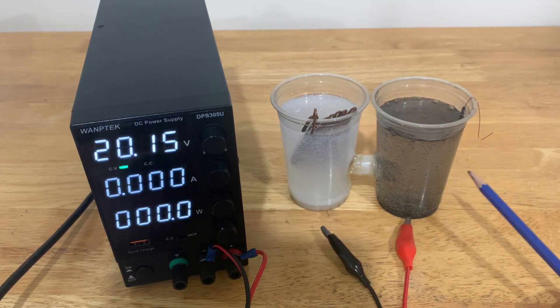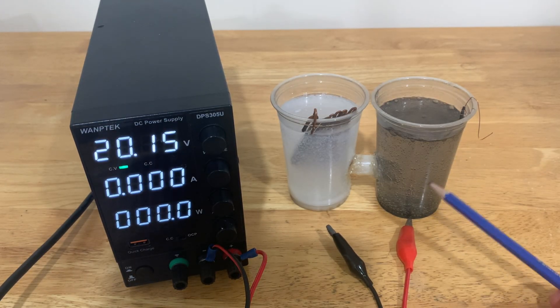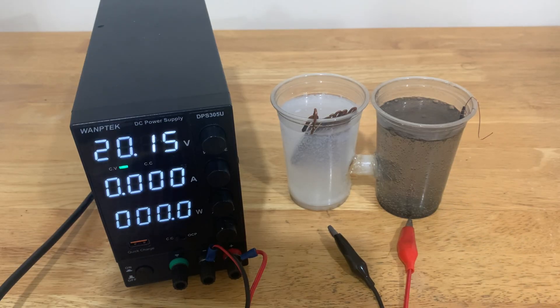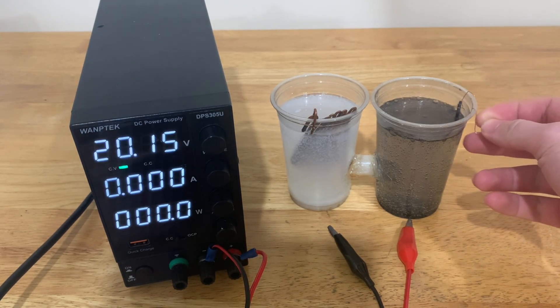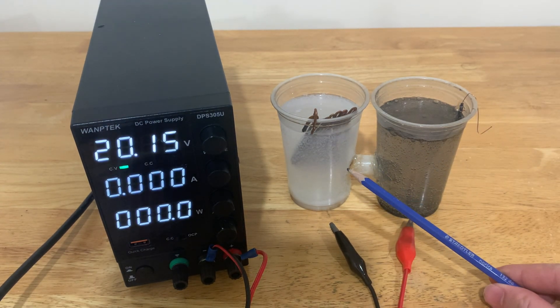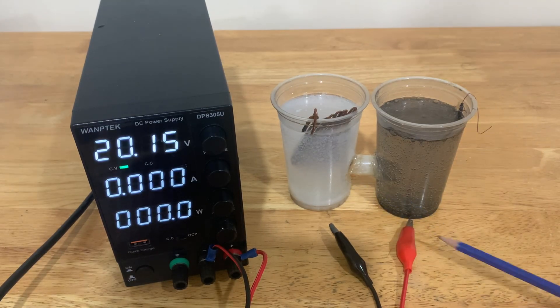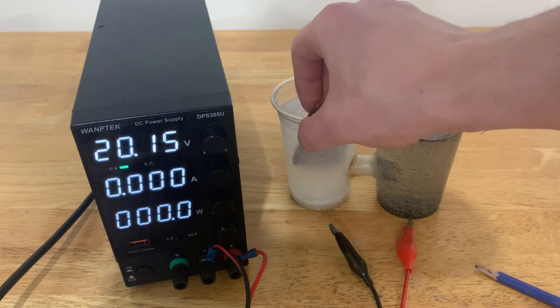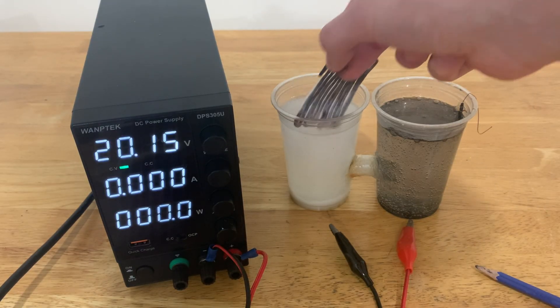Eight hours later, I've returned. As you can see, the side on the right has a bunch of chunks of the electrode floating at the bottom, and a bunch of oxygen bubbles along the walls. The electrode is actually somehow mostly fine. On the left side, however, it's foggier than my future — at the bottom there is a solid white precipitate layer, and the electrode itself has a bunch of precipitate growing on it.